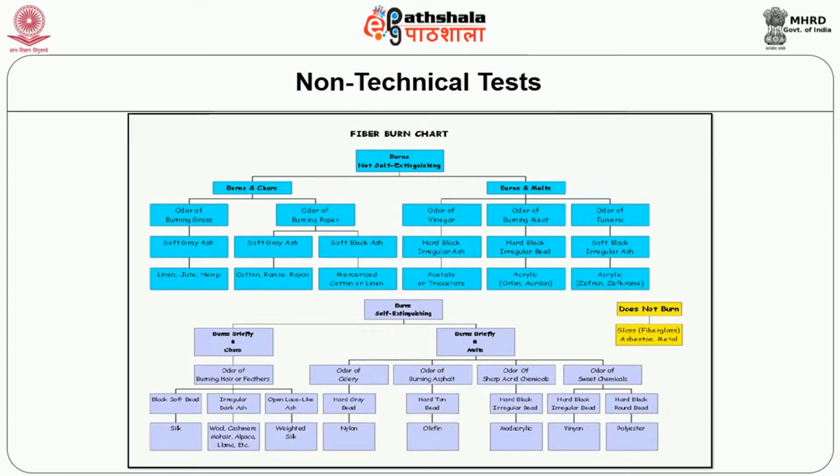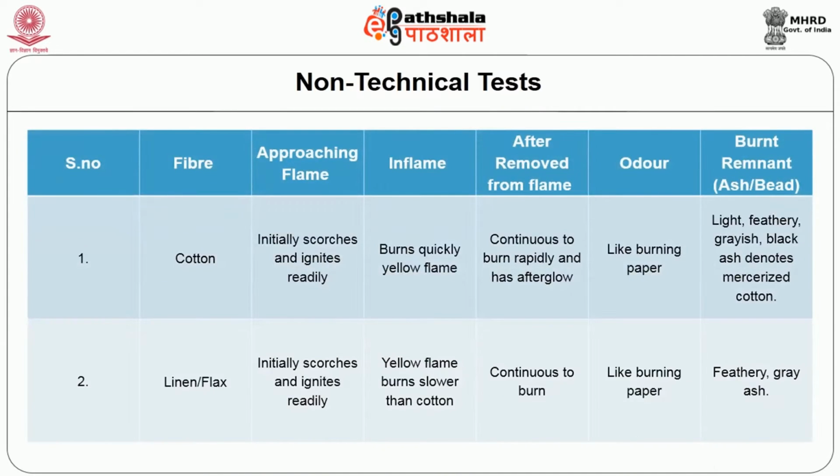We will see the various stages and two different observations through odor and burning remnants. Under the burning test, we will see the three stages of burning and two outcomes. One is odor, another is burnt remnant like ash and bead. First is the cotton fiber.